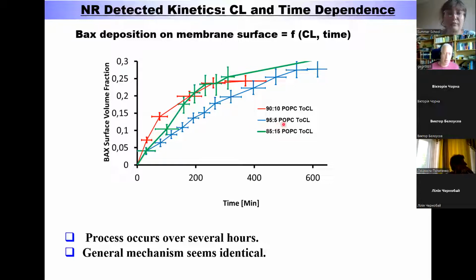I think it was standing too long, so there were bubbles on it. But you see the behavior is similar. If you have a lot of cardiolipin, it goes faster. If you have not much, it goes slower. But the endpoints are probably quite similar, because after a while, the same amount of bugs will have made enough pores and removed enough lipids.